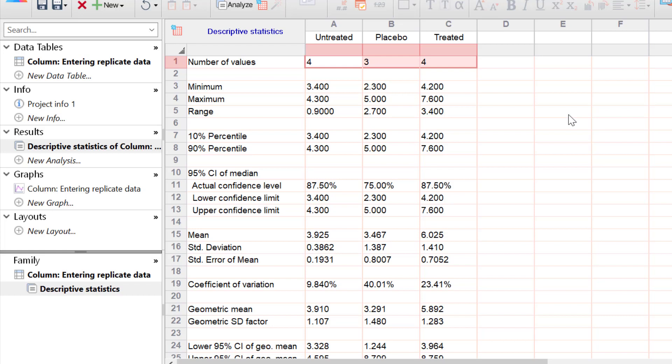In this video tutorial we've learned how to generate descriptive statistics to retrieve an overview or snapshot of your data, such as values of the mean, the standard deviation, and the standard error of the mean. These values are very important when you want to report an overview of your data set.